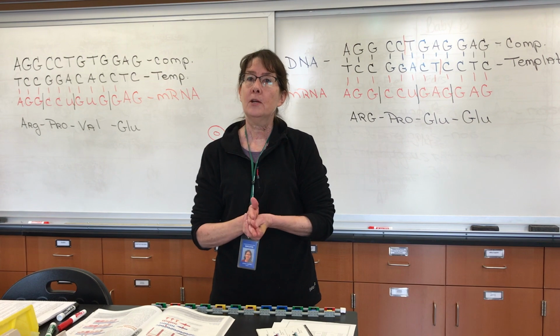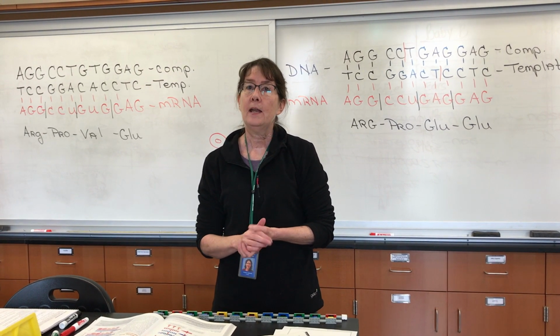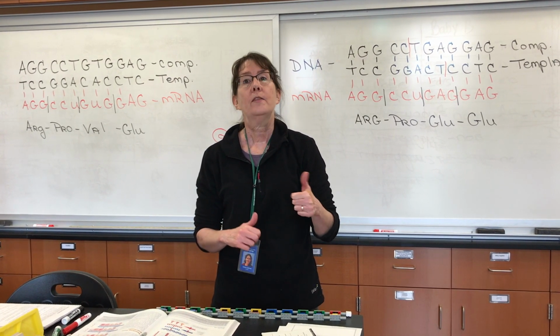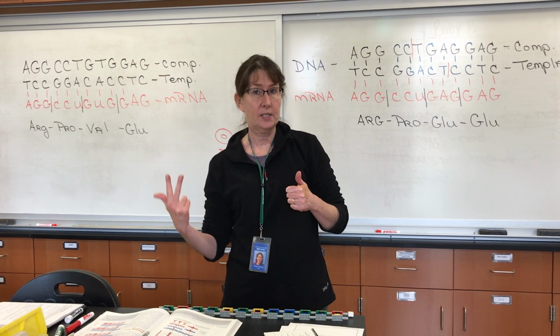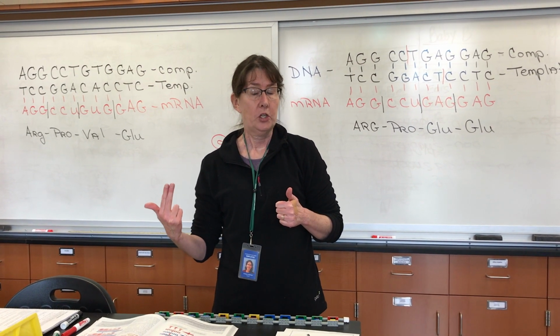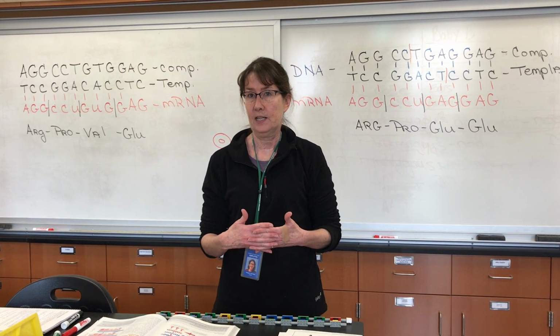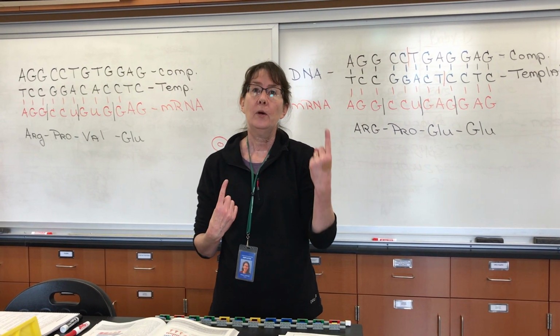And that's the premise we'll use to be able to tell next week whether someone has the 2 normal genes for hemoglobin, whether someone has sickle cell disease in the 2 sickle cell genes, or whether they are a carrier for sickle cell disease, meaning they have 1 normal gene and 1 sickle cell gene.